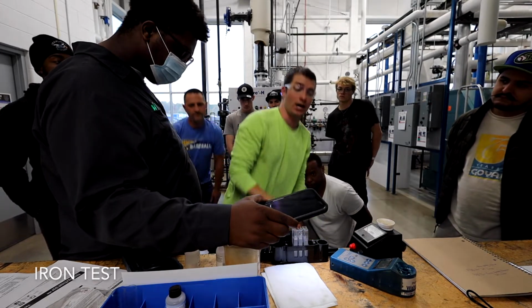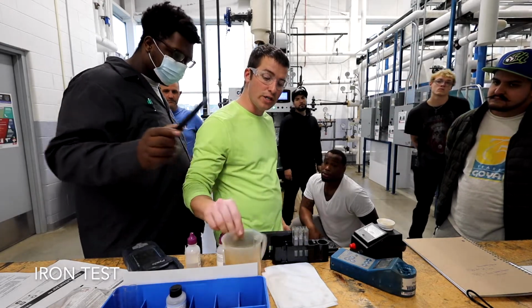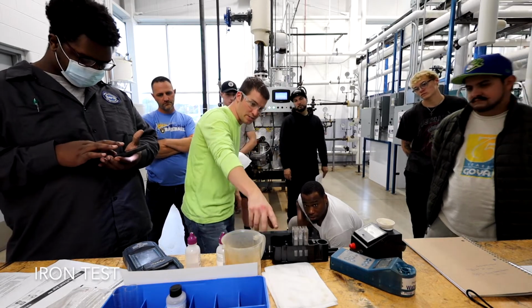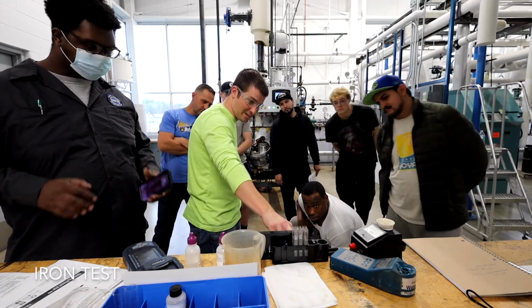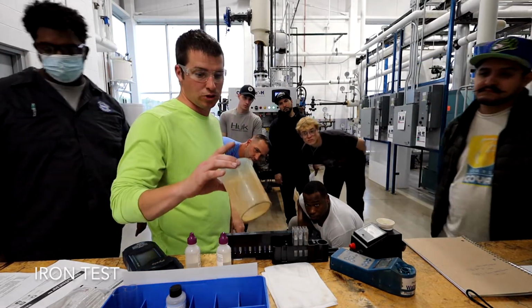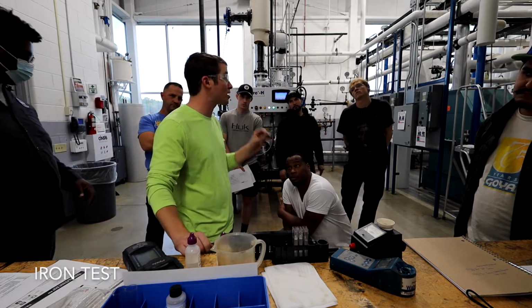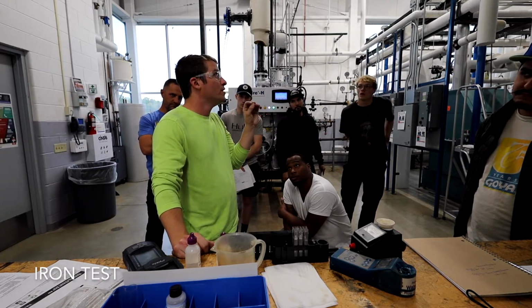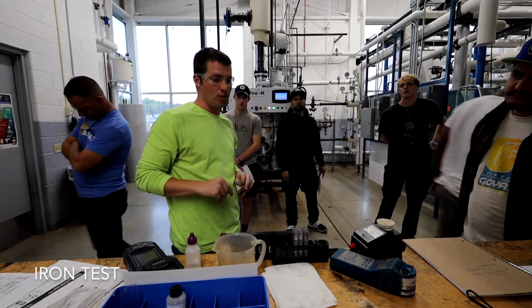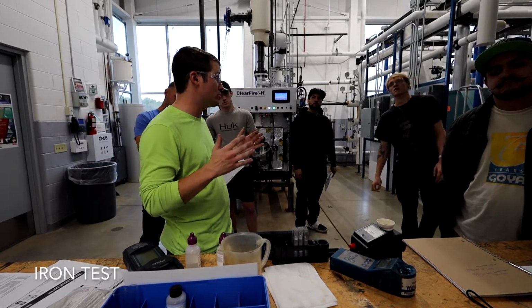And again, mine could have been higher, because I might have gotten some of that little crud in my test that is going to skew it slightly. But I think this middle one looks like somewhere in here. So it's low, and I do think it's actually pretty low just looking at the water. I do think that little bit of stuff can go a long way when we're talking 0.1 parts per million. It's not even 1 out of a million parts. That's such a small number that any little bit of residual you get in your cup can skew your test.